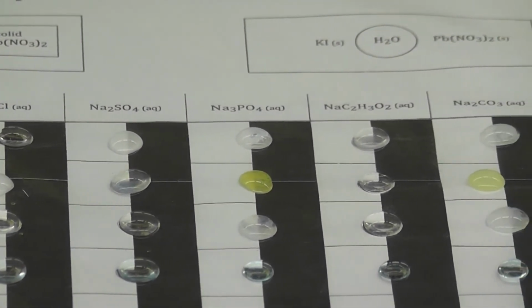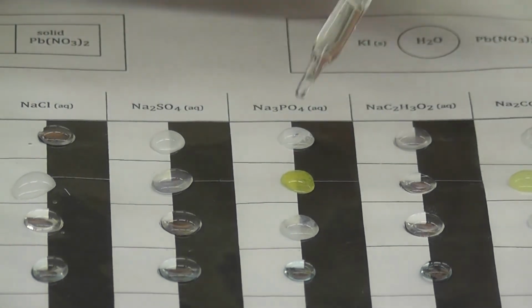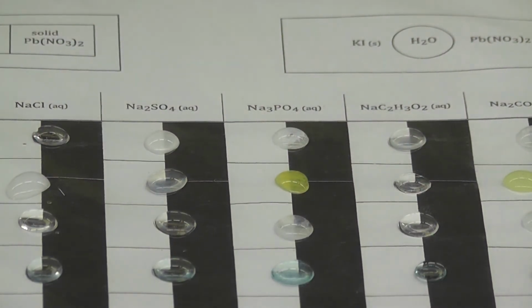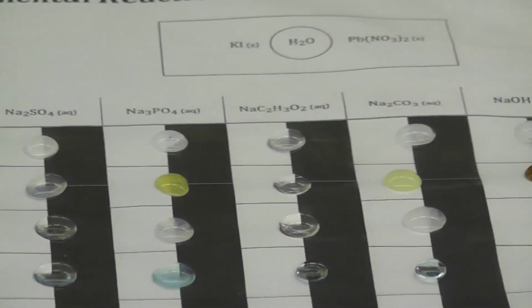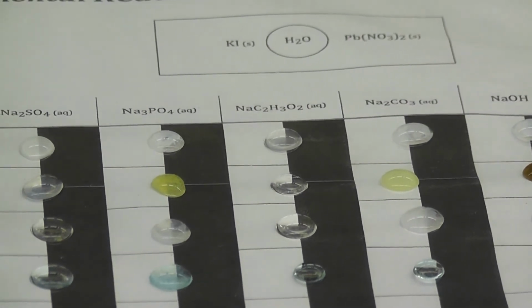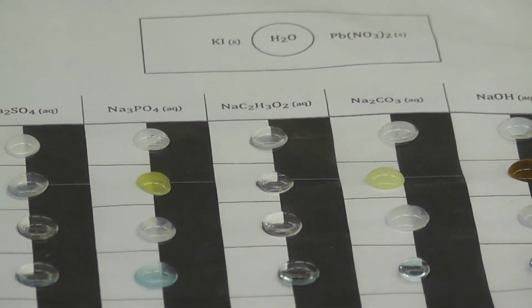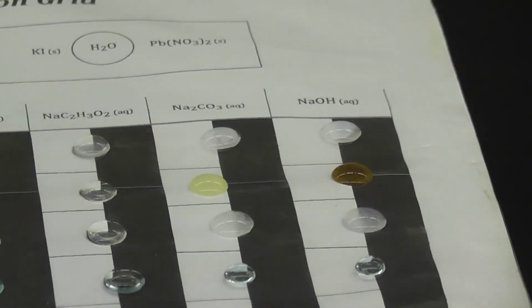Next, copper 2 chloride with sodium phosphate. So we're going to add 1 drop of sodium phosphate to the copper 2 chloride. Ooh, that was kind of cool. Okay, copper 2 chloride with sodium acetate is next. So add 1 drop of sodium acetate. We have that. See from the side. Okay.